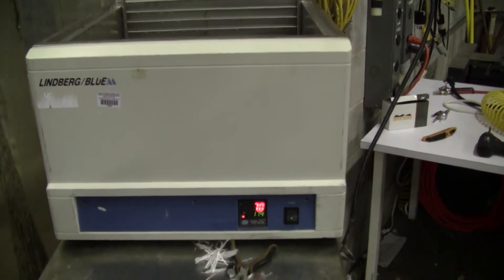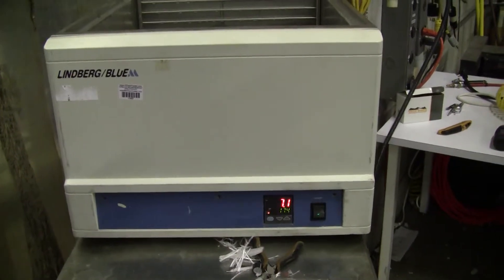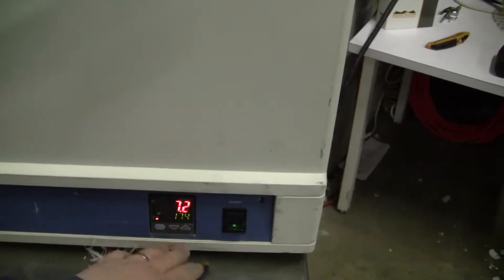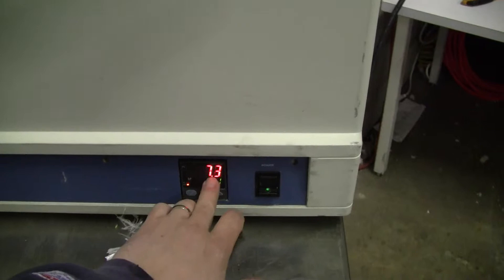Hi, this is Michael Naitow from HitechTrader. Today we're looking at a Lindbergh Blue M water bath. Very easy temperature set — just indicating that it goes up, goes down, and it's reading the temperature.